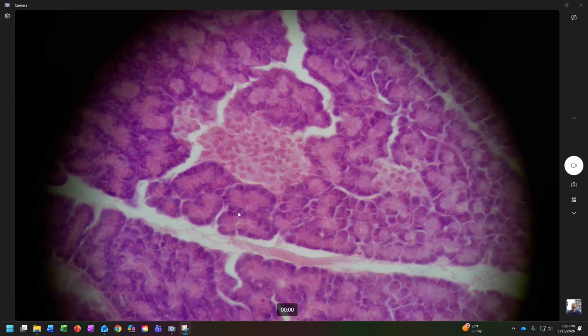But here's our pancreatic islet. Notice these cells here. Again, I told you we would see those cells kind of surrounding a space. Notice there aren't any nuclei in that space. Those are all the pancreatic acinar tissue. And so these cells are secreting things into that space that will eventually converge into larger ducts, and those larger ducts will empty into even larger ducts, and eventually you get to the largest one, which is the main pancreatic duct, and that's what gets you to the small intestine. But we're not worried about those. We're worried about these here.